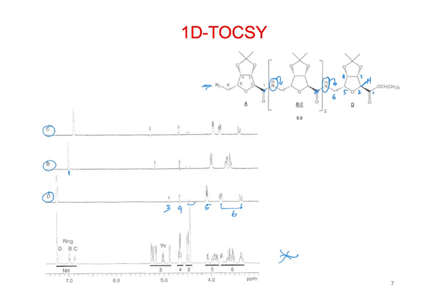Oh, cool. And so you can just go through, and if you were working on peptides, or maybe even bigger proteins, they have just these patterns. And I think they probably even have computer programs to identify these patterns within the spectrum. That's dope. Yeah. So handy.